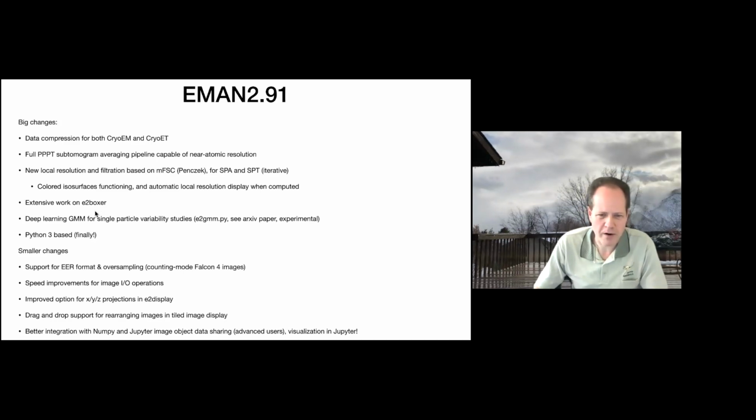We've improved E2Boxer. There have been lots of complaints over the last decade or so about E2Boxer and us not having good documentation for it. So we made some internal improvements so it self-documents a little bit better, and you can actually figure out how to use the auto boxing tools in it.